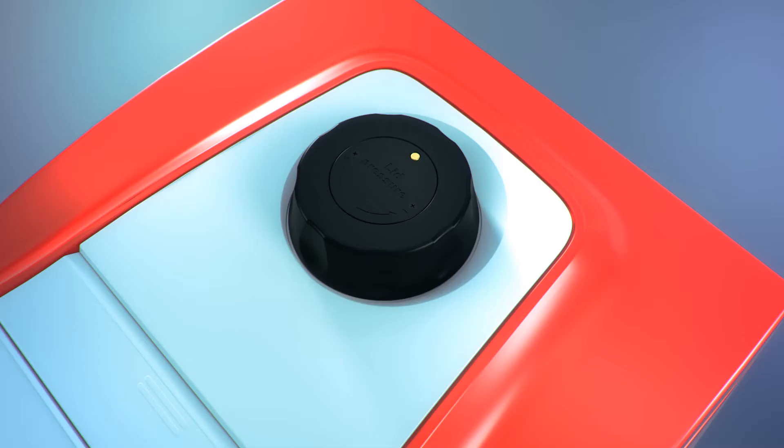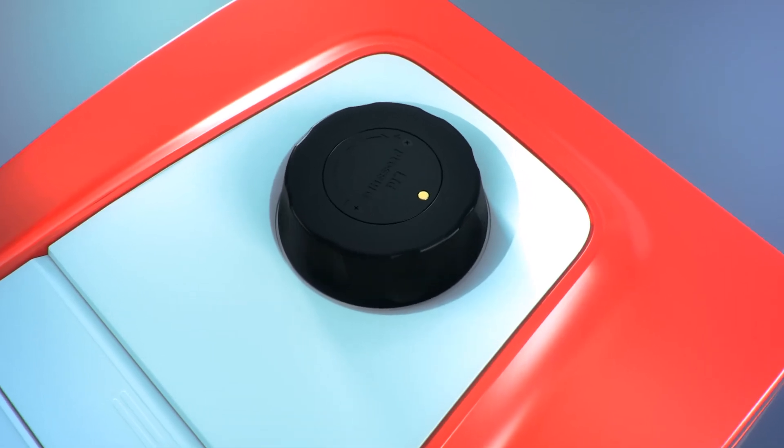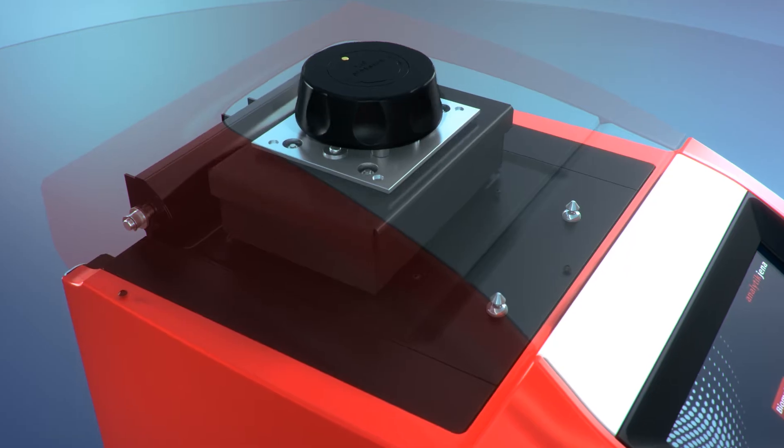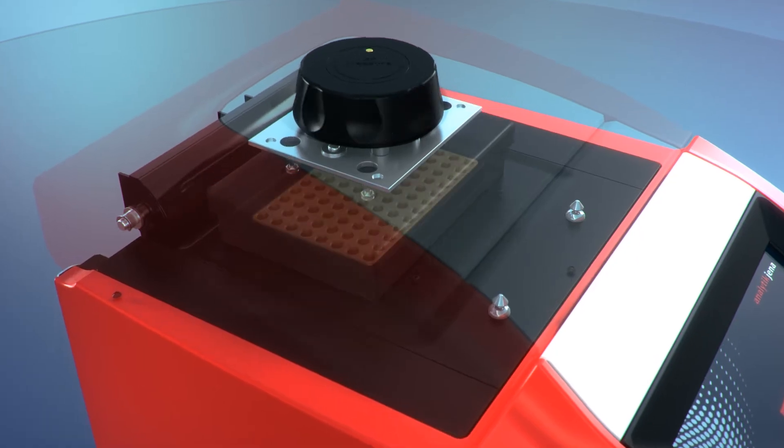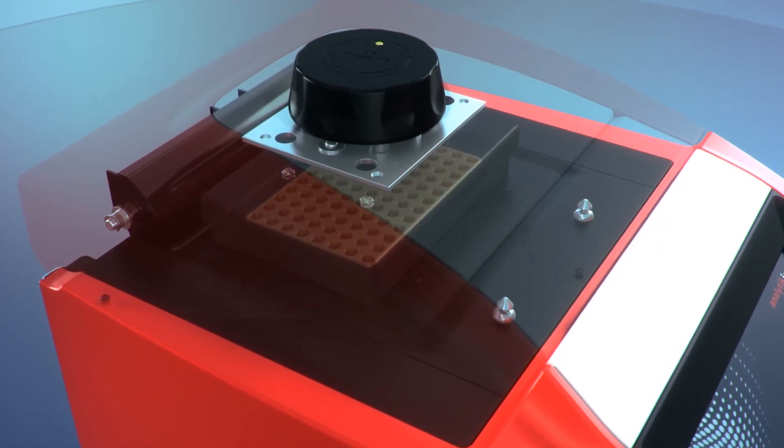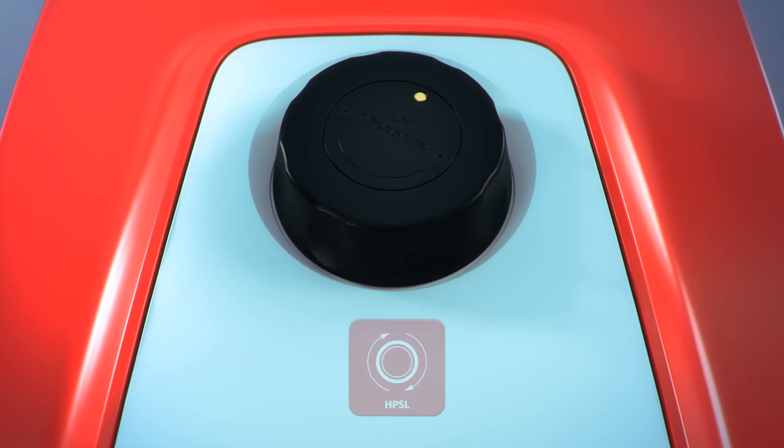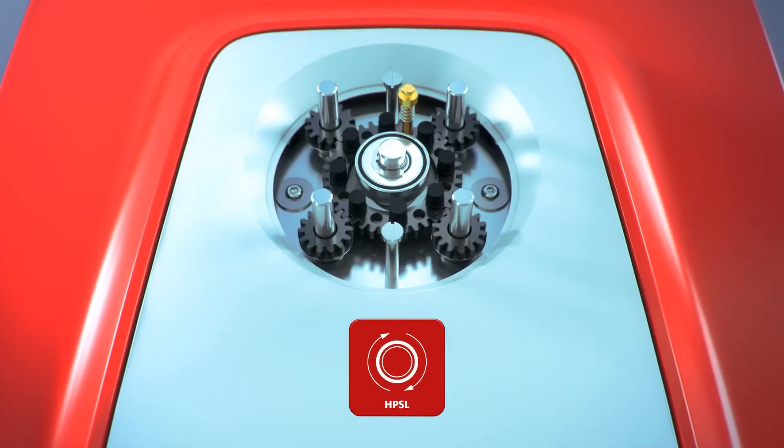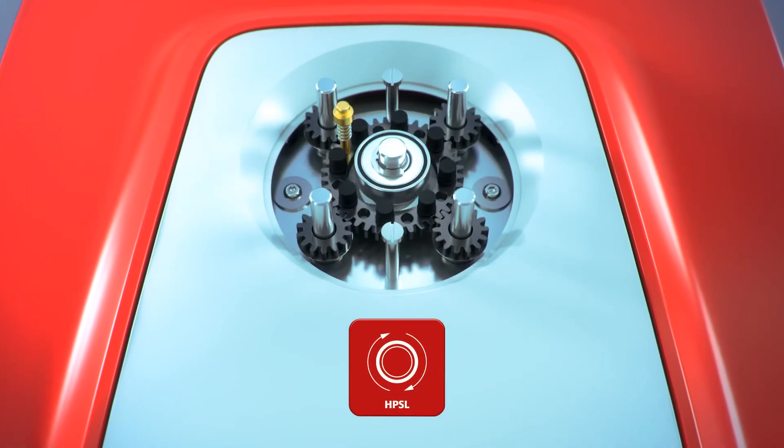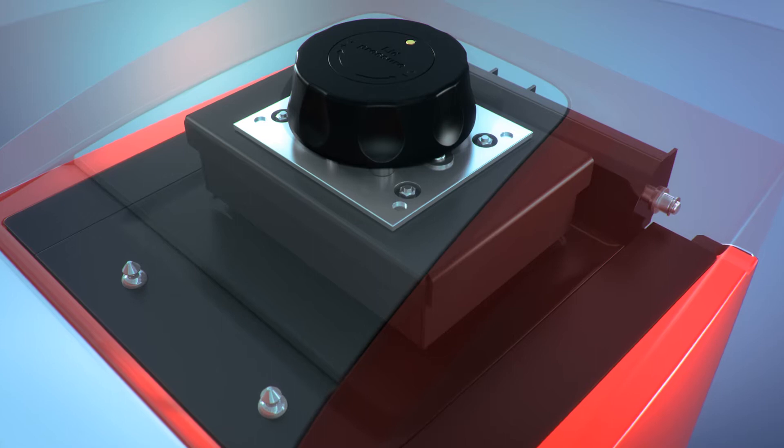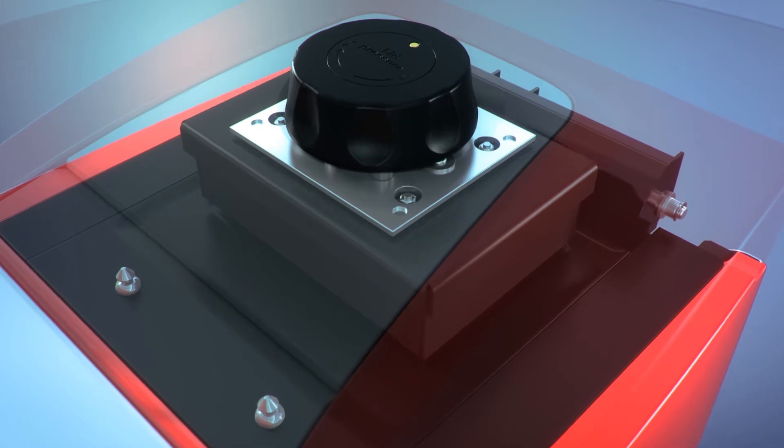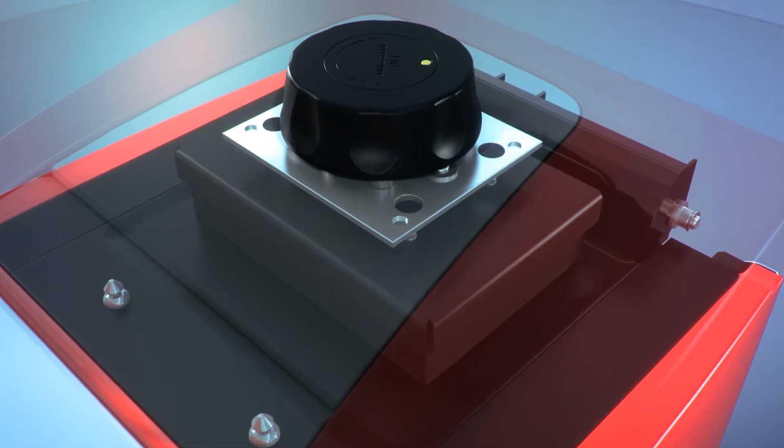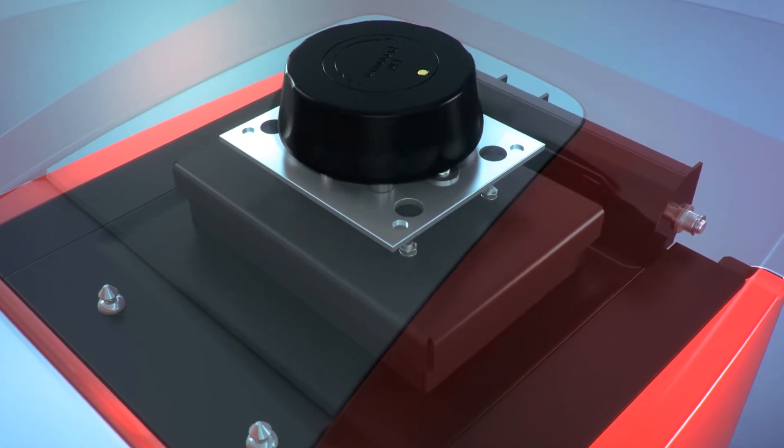By high-performance smart lid, reliable contact pressure independent of the used plastic wear is ensured. Turning the lid wheel moves the heated lid up or down. The integrated clutch mechanism prevents over-tightening the lid wheel and ensures high reproducibility of PCR experiments.